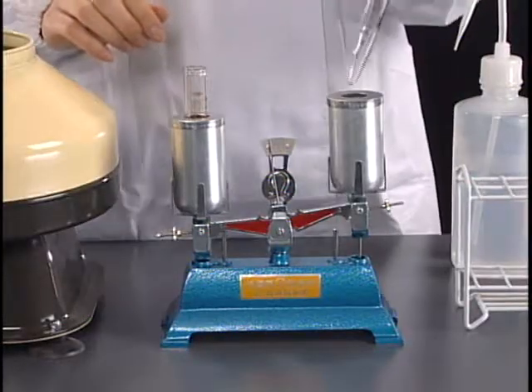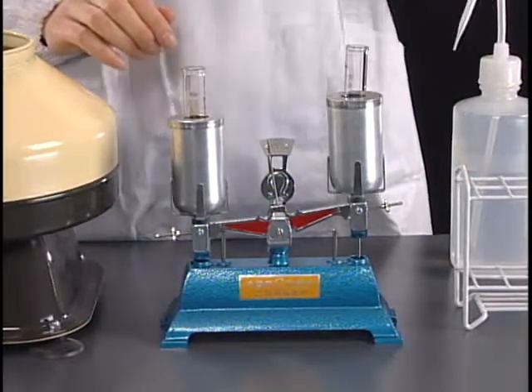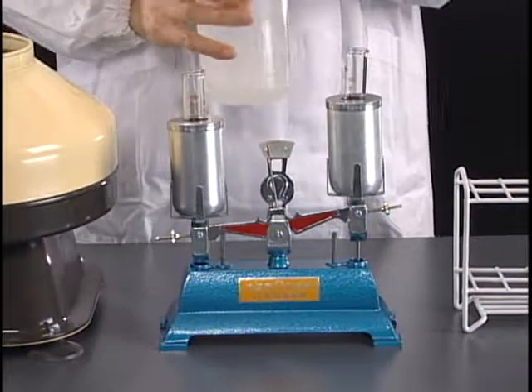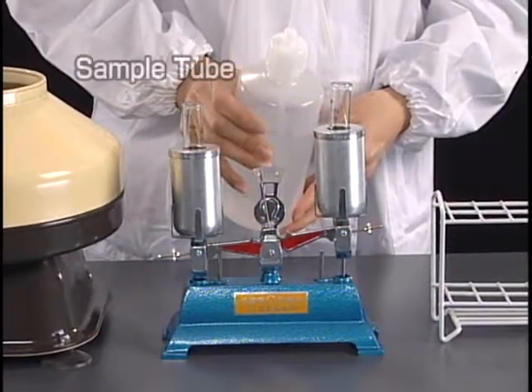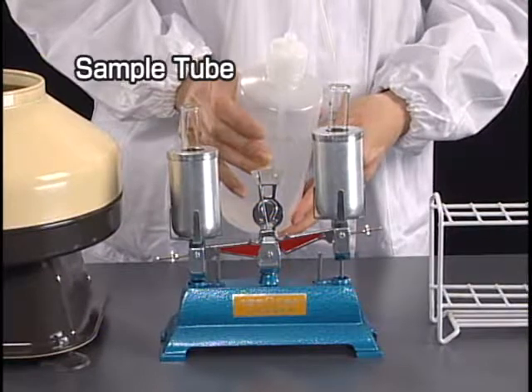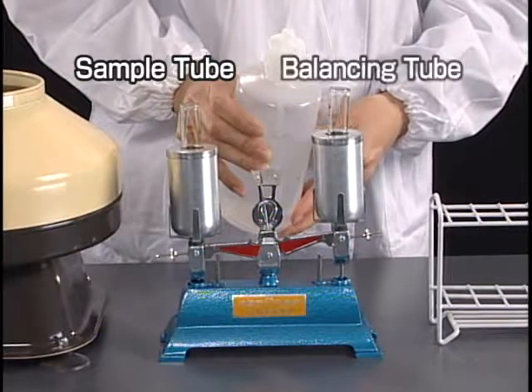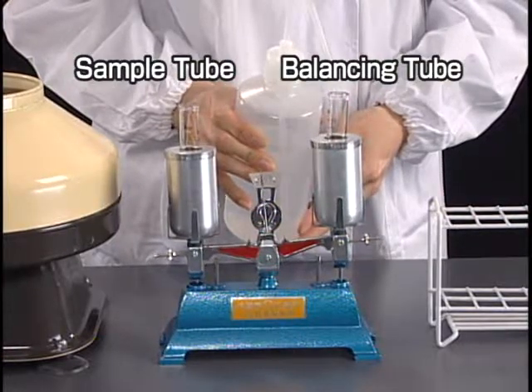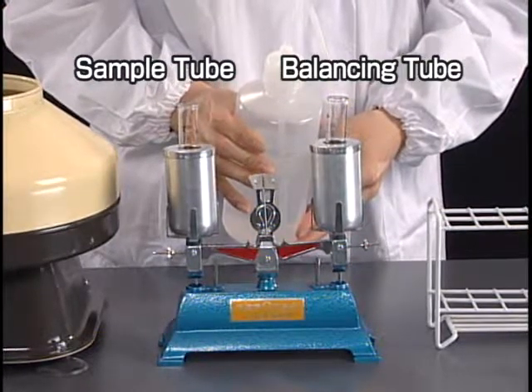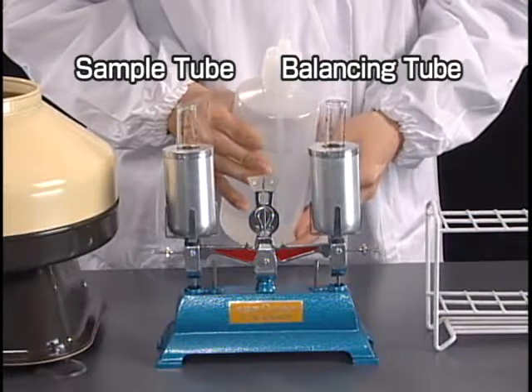Along with the sample tube, another tube is required to maintain the balance. If the weights of the two tubes are not equal, a serious accident may occur. On one side of the balance, place the centrifuge tube containing the sample and in the other place the tube for balance.